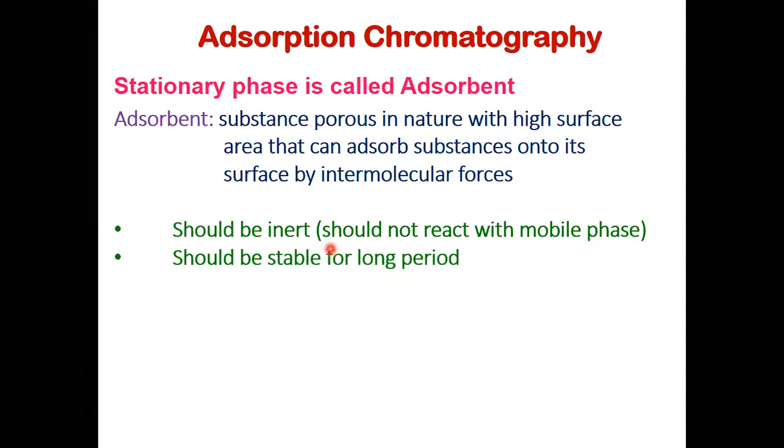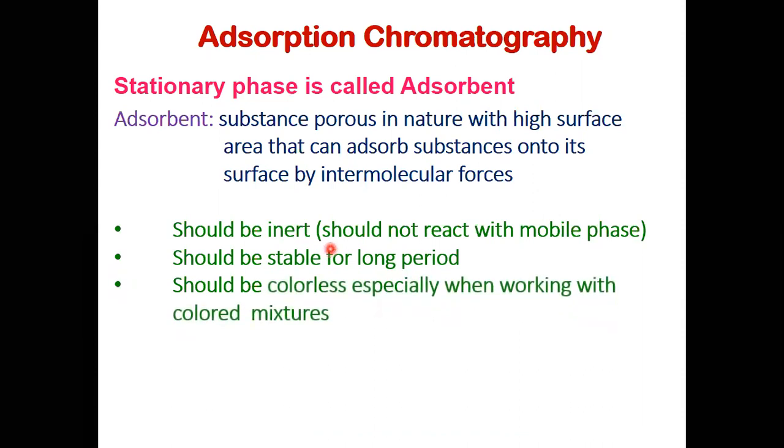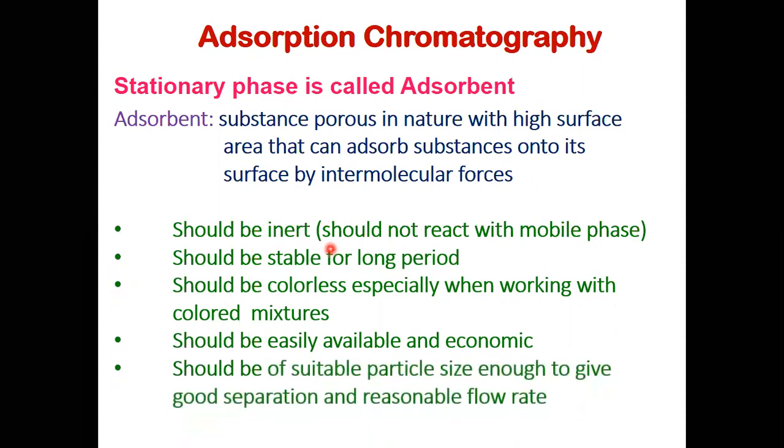Adsorbent should be inert, should be stable for a long period, and should be colorless, especially when we are working with colored compounds. It should be easily available and economic. And the main thing, it should be of suitable particle size that can provide good separation and reasonable flow rate.